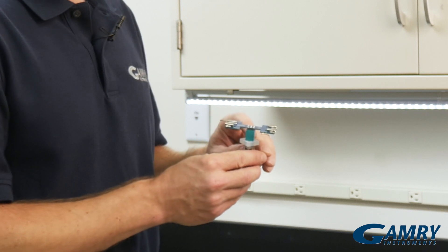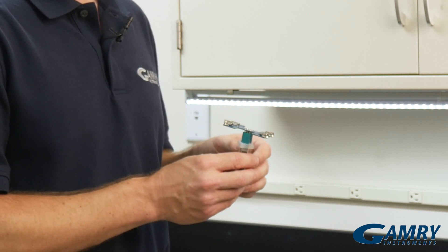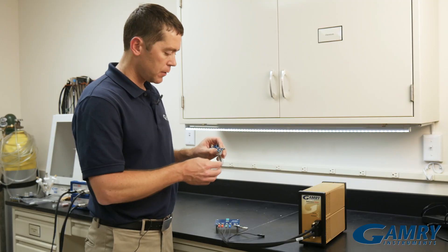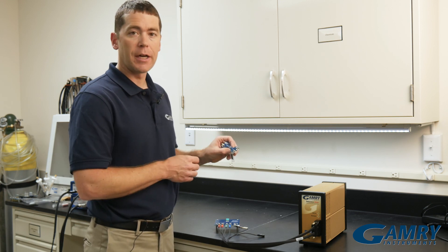The top of this lid also has holes for bubbling in argon or nitrogen, so you can deoxygenate your solution. You make your connections much like I just showed on the other holder — it has your working, working sense, your reference, and your counter connections.